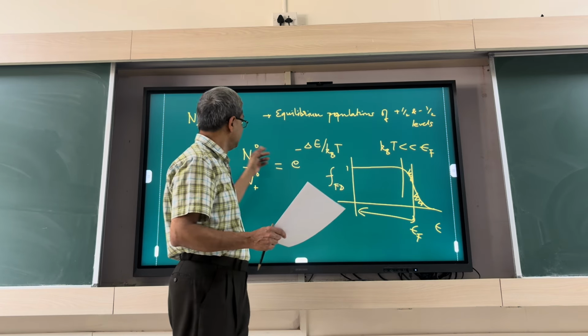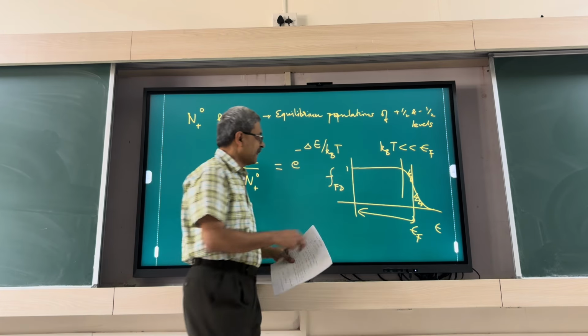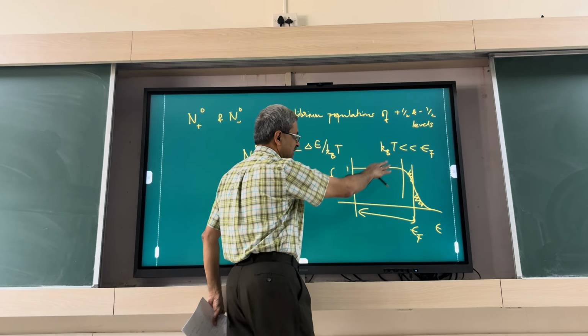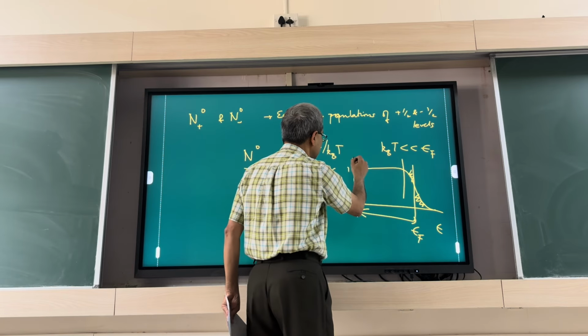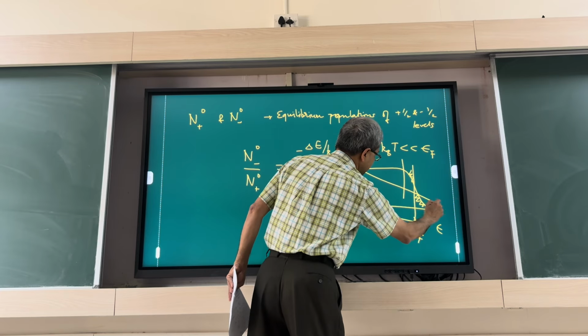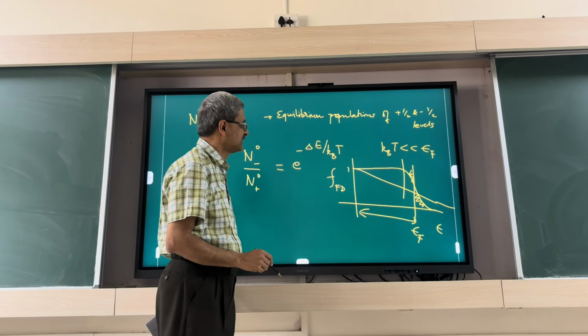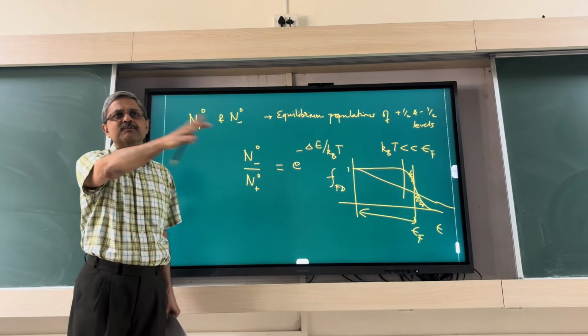In contrast, here you are the other way. How does this evolve with temperature? Suppose you could go to tens of thousands of K, then this is still 1, but it becomes like this as temperature increases, and you're almost just exponential all the way from 0.